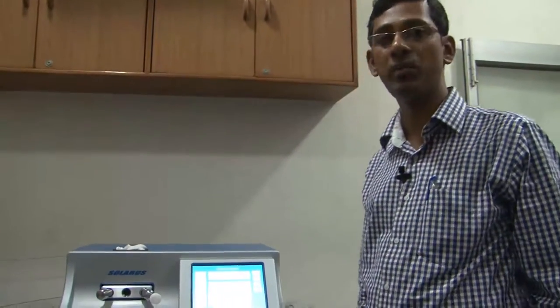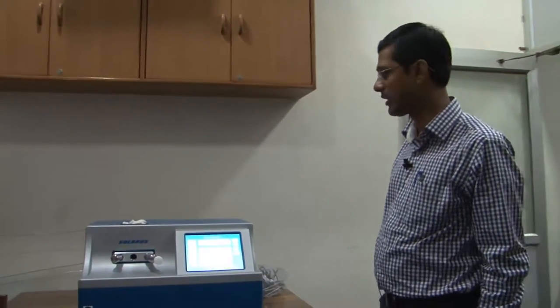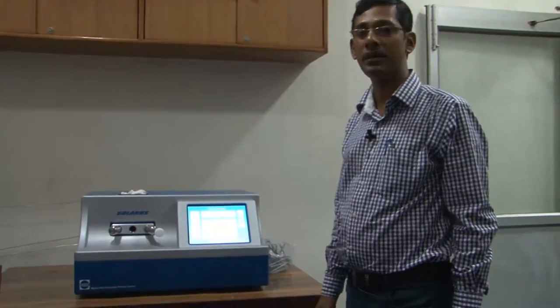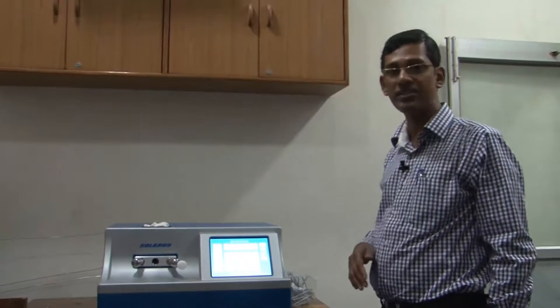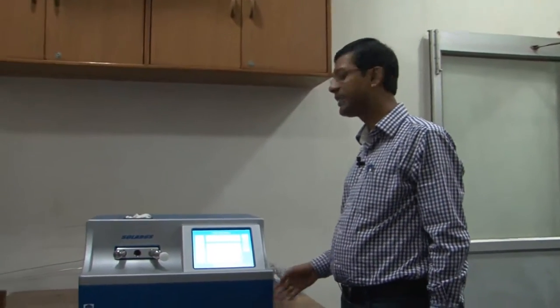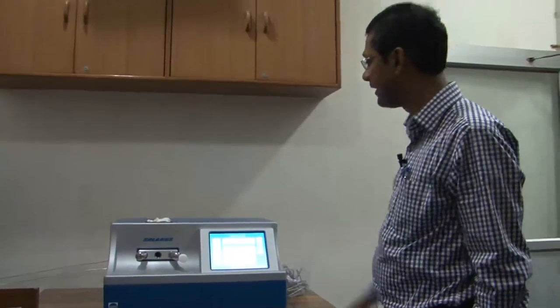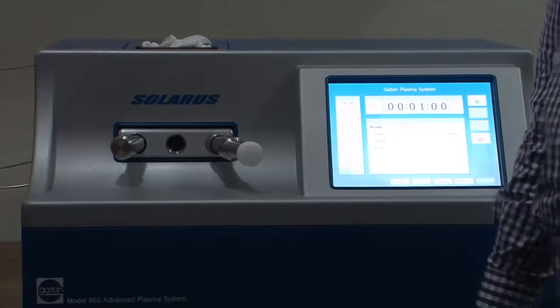Modern day electron microscopy requires sample preparation. Sample preparation is one of the biggest bottlenecks in getting high resolution microscopic images, so sample preparation technique has seen a sea change over time. I will not be able to discuss the different sample preparation procedures. But even after the TEM sample is perforated and thinned down to the electron transparency level, the sample surface can have oxides or other contaminations. To make it contamination free, for analytical microscopy and also for high resolution purposes, the machine used is known as a plasma cleaner. It generates plasma using a gas or gas mixture like hydrogen, argon, oxygen inside the machine, and we can load the sample in a TEM sample holder inside it and clean it using the plasma.